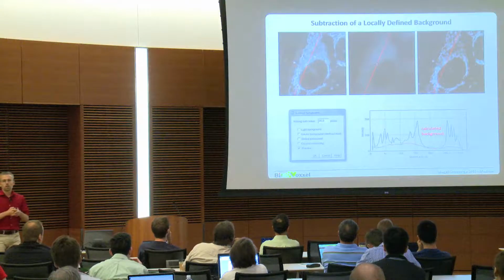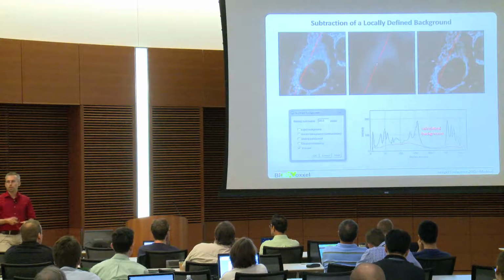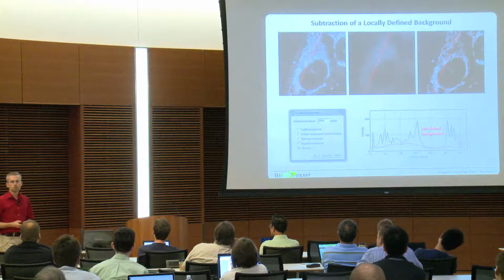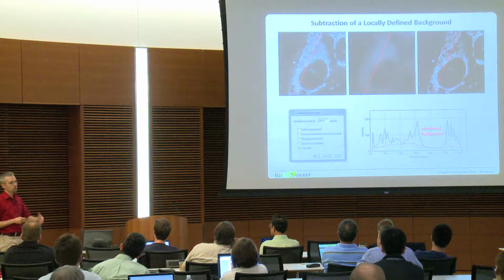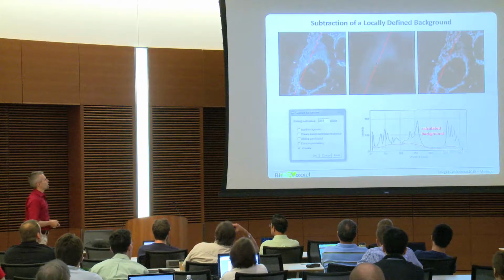What I often hear from people is, yeah, we used that subtract background and then keyed in numbers until it looked good. I wouldn't do that, because you have seen in Ari's talk that humans can perceive only around 60 intensity levels or so. So if you see that it looks good, it might already be too much or too little.